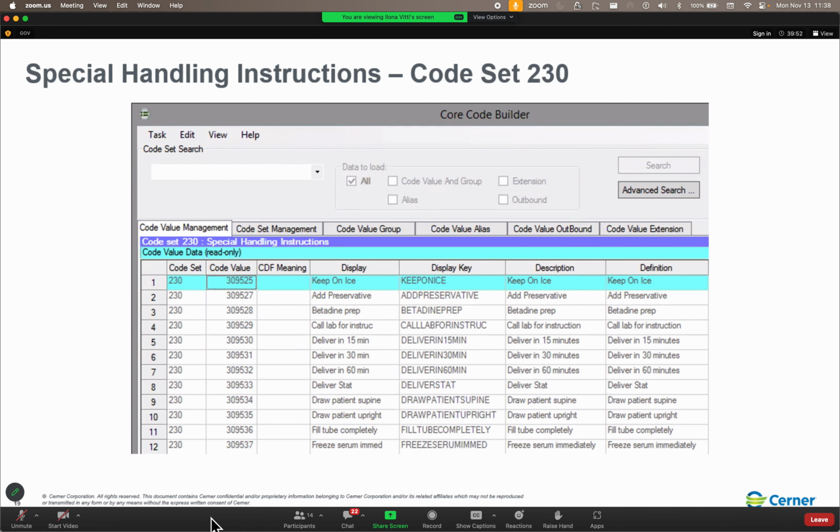So when we're going into transfer specimens and we're creating a frozen transfer list, only the containers that are currently in the location associated with the from tracking location, that have the in-lab location associated with the to tracking location, and have the frozen collection class on the orders in that container will qualify for a frozen transfer list.